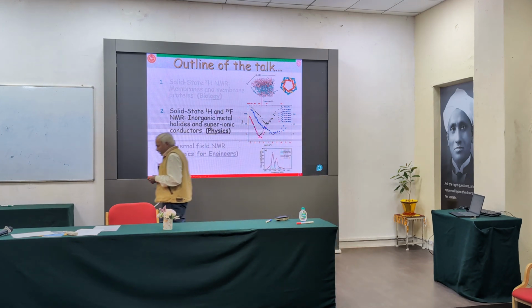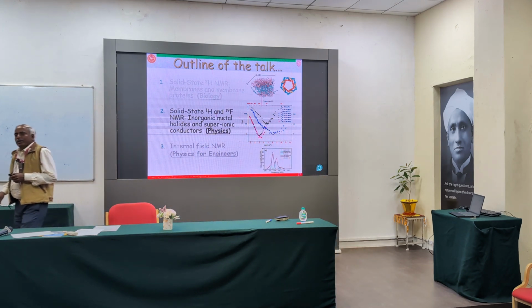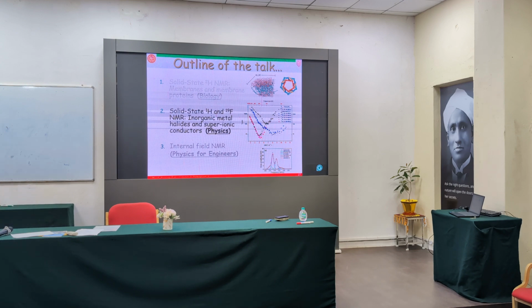Shashi Kumar would address solid state NMR, where he talks about how, whenever I am taking a liquid, molecules are rotating or freely moving in the system. Hence, your relaxation time is different. Whenever I take a solid, then they are a bound system. They cannot release their energy immediately. Then it is hard to get a good NMR spectrum.